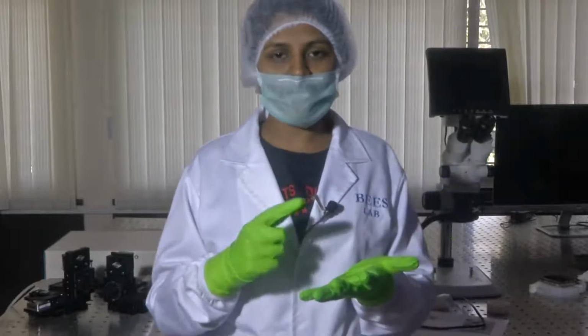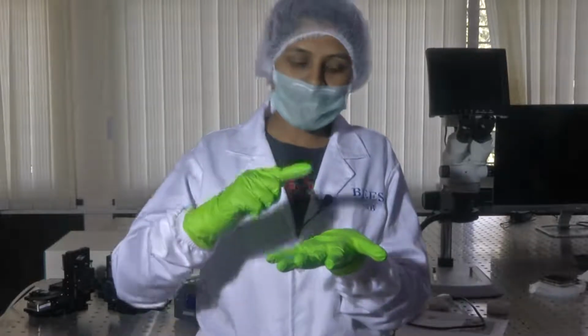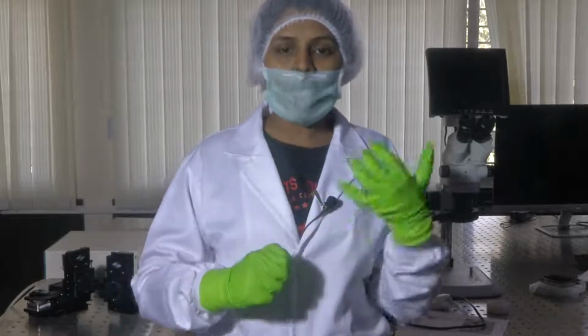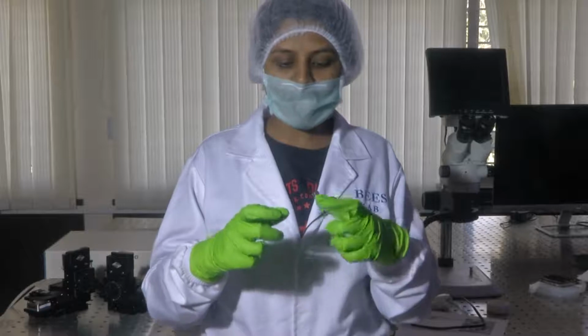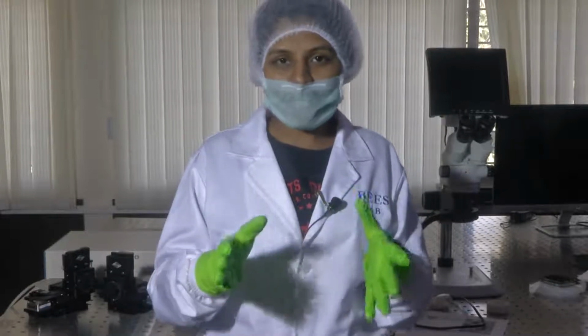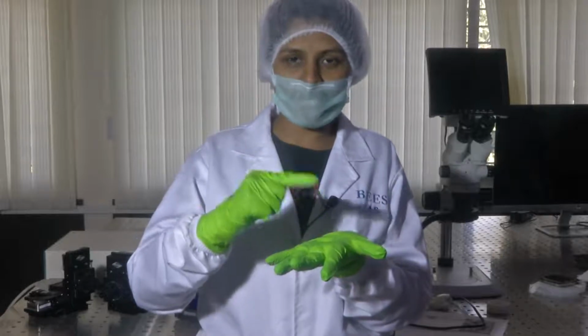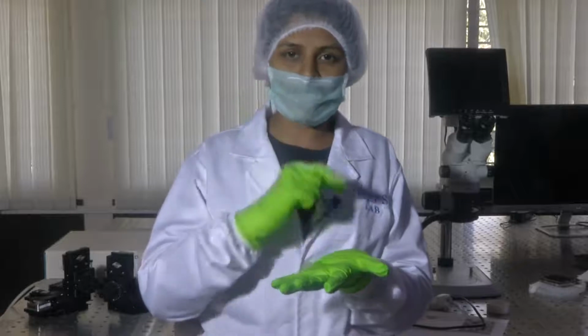There was work where AFM-based cantilevers were used to indent tissue samples, so you know the amount of force that is being applied. But there is no feedback, so you do not know the change in length. You have just the amount of deformation, but how do you quantify the amount of force? This is the light source which is coming.